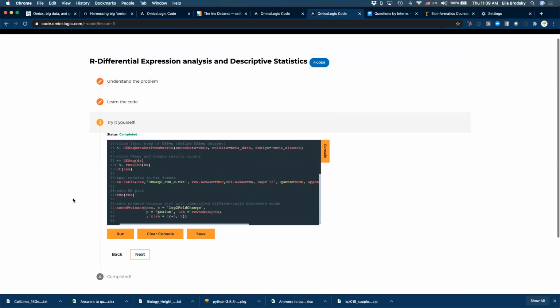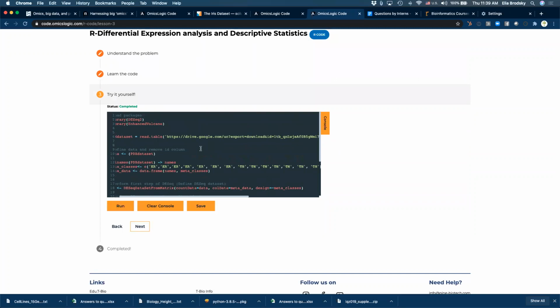You will see here, let's see if this is loaded. What you will see here is that we are comparing samples from two types of breast cancer, ER positive and triple negative. We are going to be looking at which genes, from the total number of genes that we have, are actually differentially expressed.